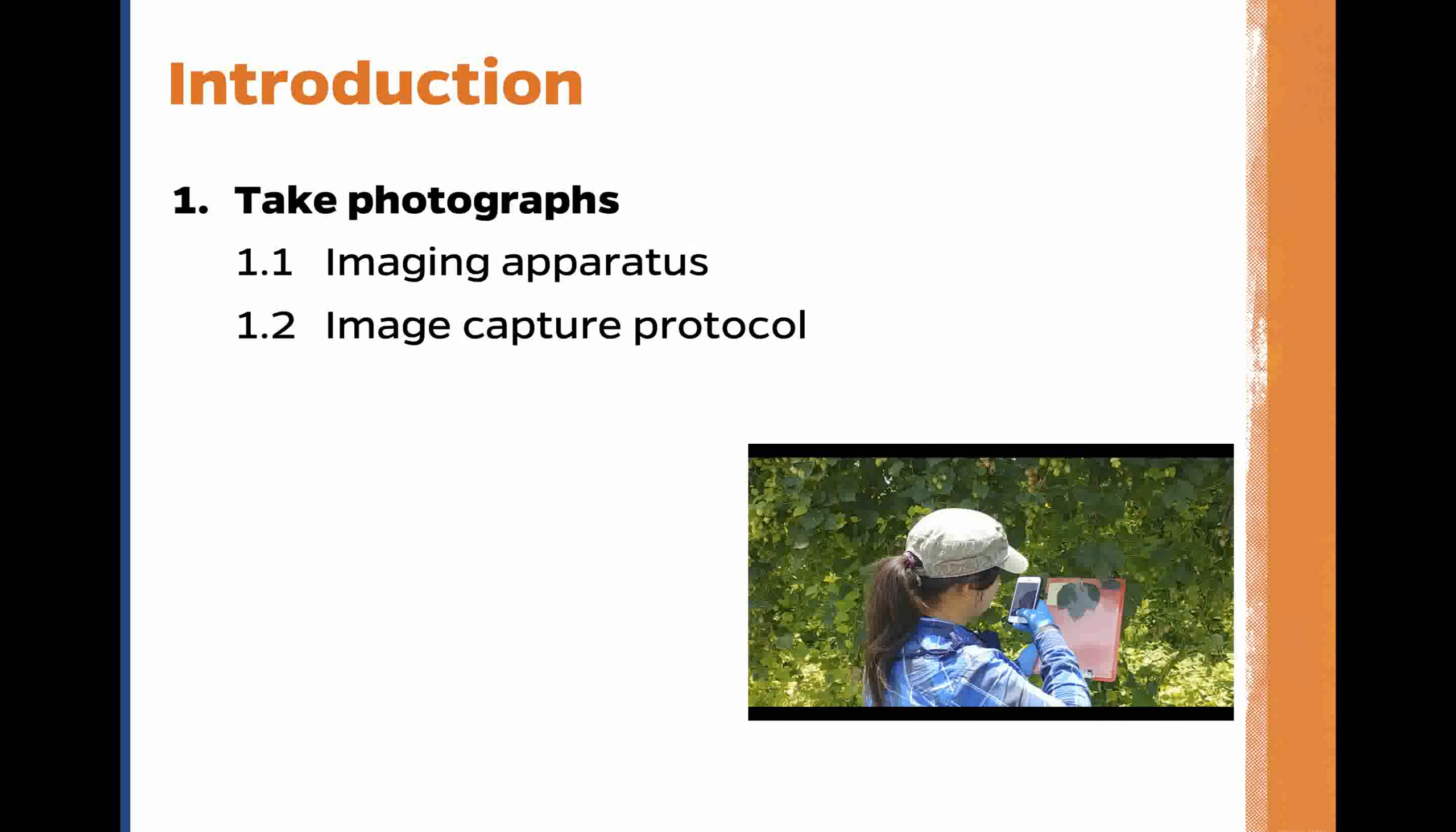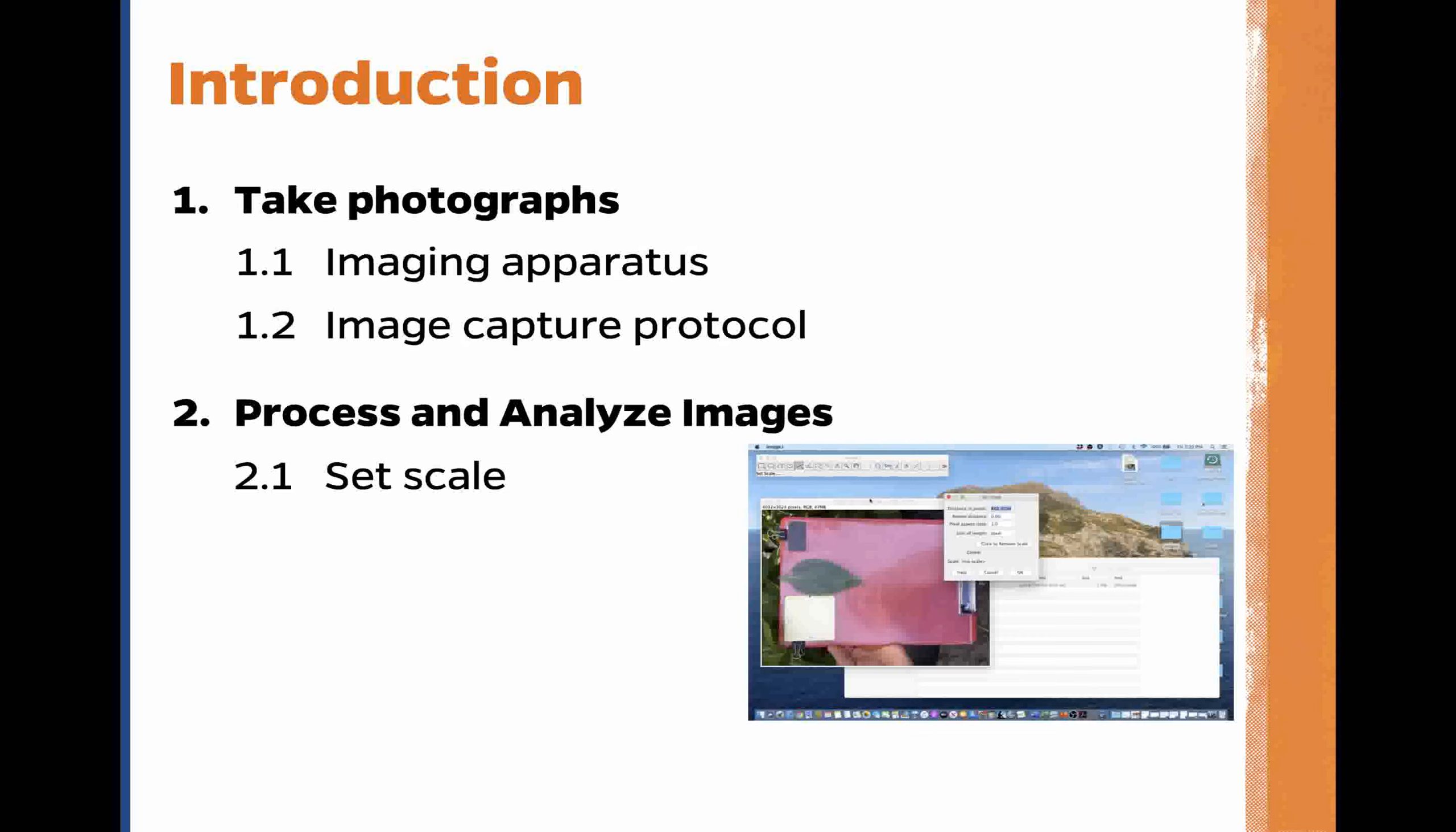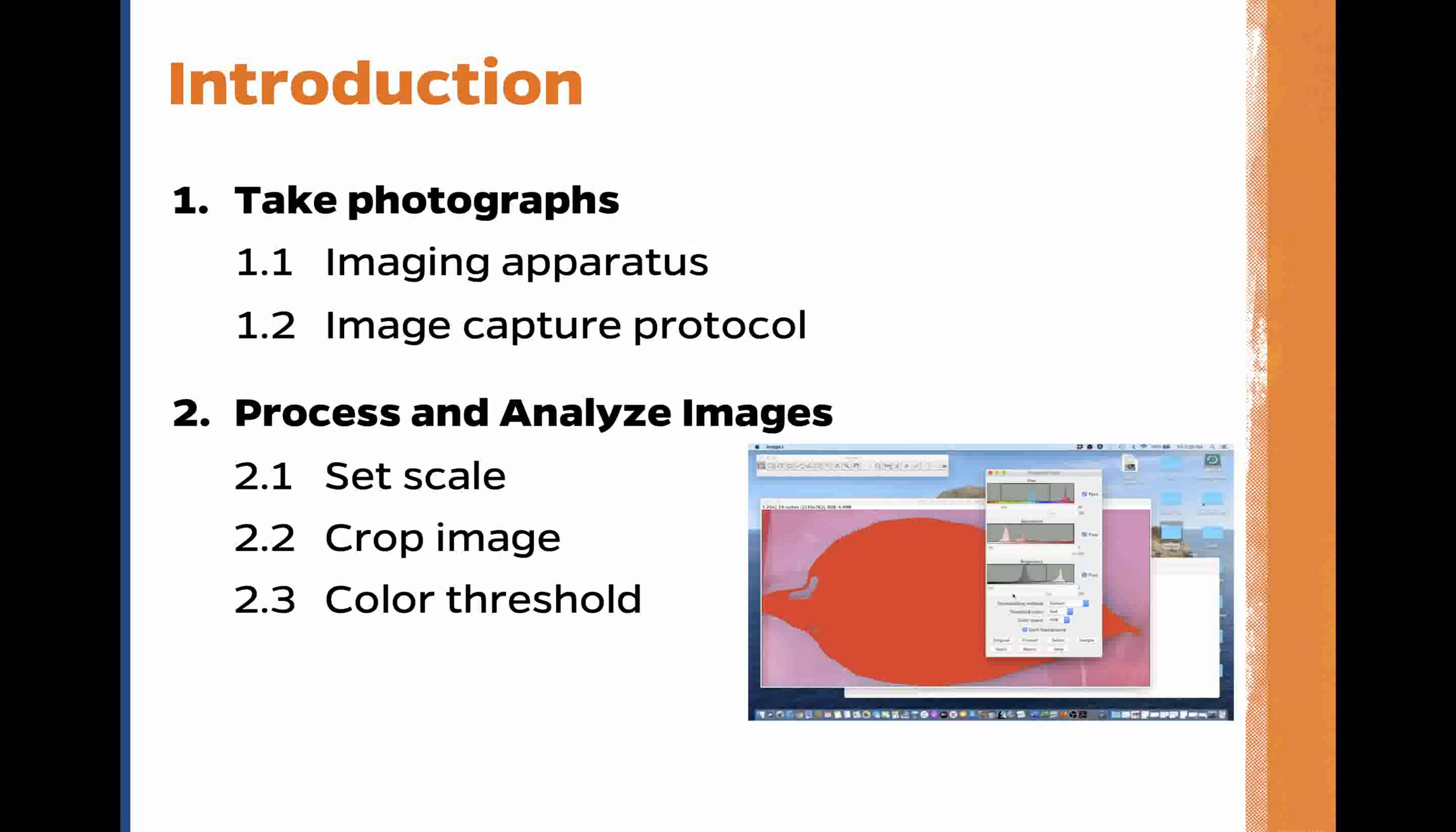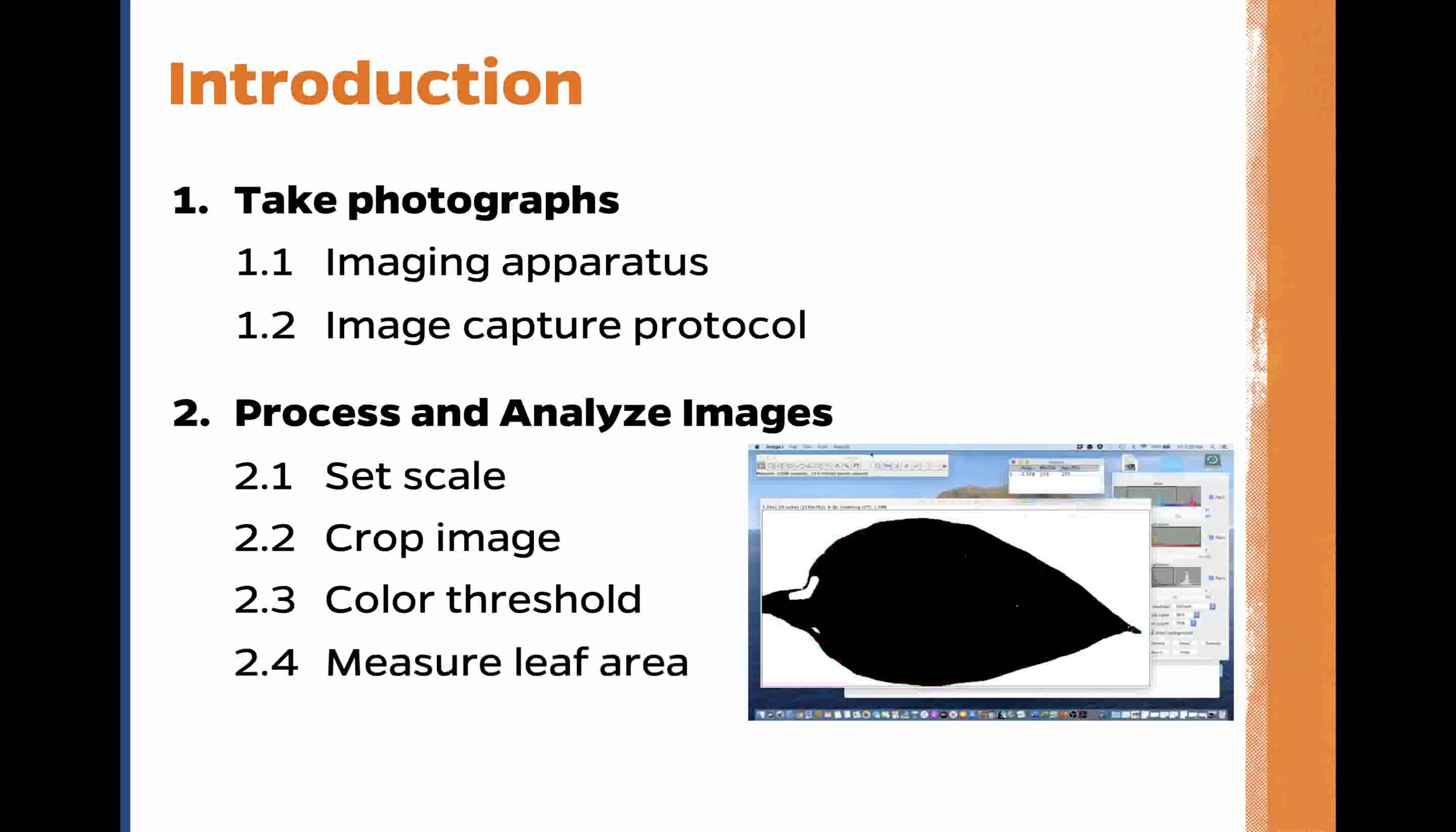We will also process and analyze images by setting scale, cropping an image, color thresholding, and finally, measuring leaf area.